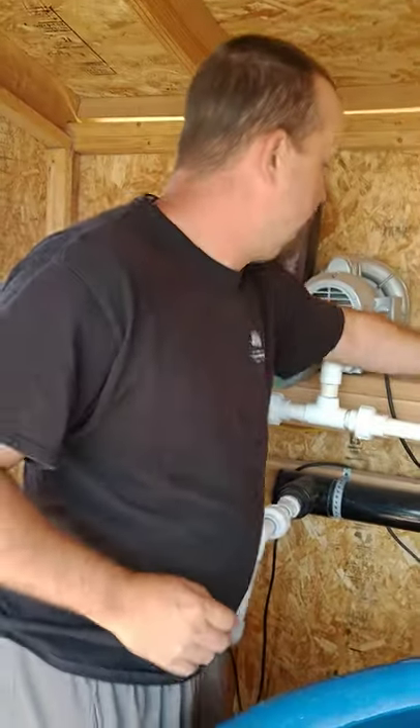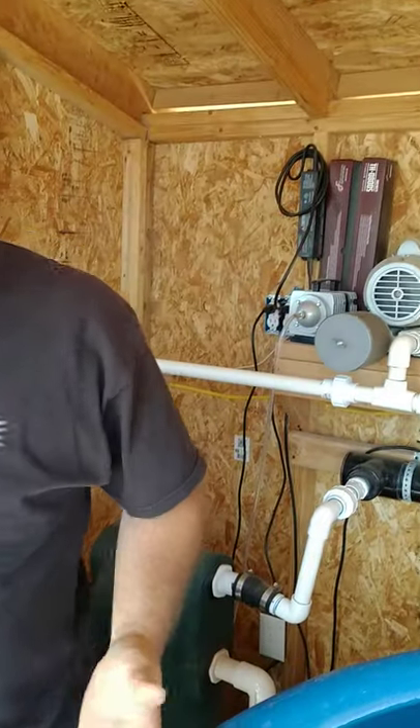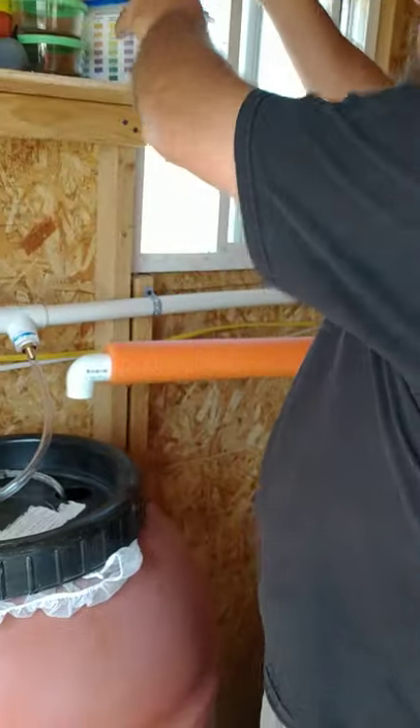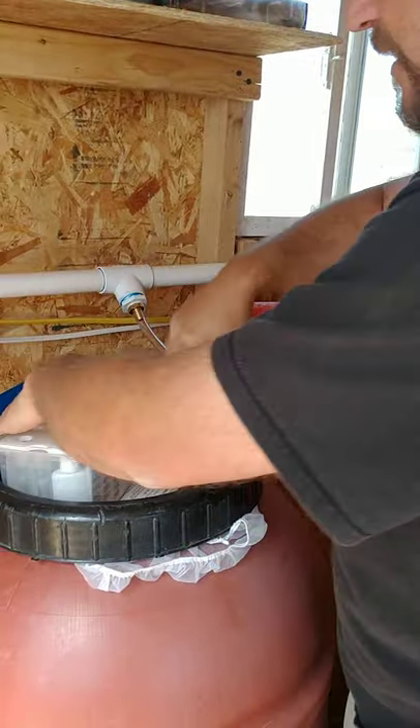Hey Roland, let me turn this off. How you doing Roland? So you were having some problems with the water quality, and what I'm going to do is step you through making sure that you do the water quality test kits correctly.